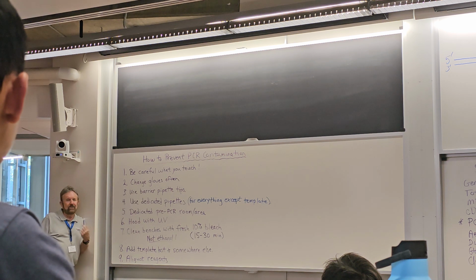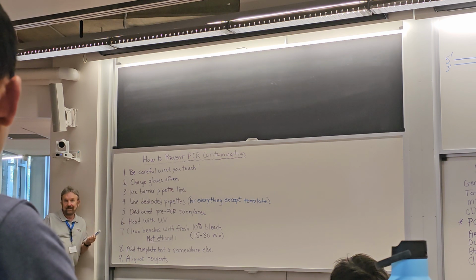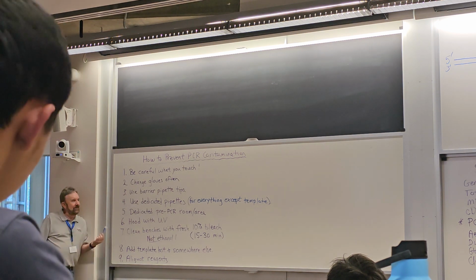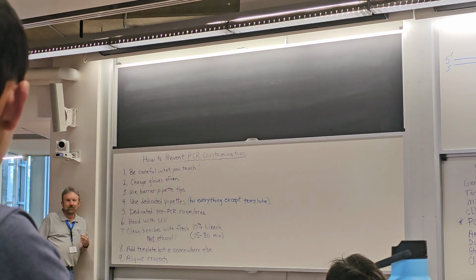You can dilute the Clorox to a 10% bleach solution, and that's ideal. Now, it turns out bleach doesn't last forever, and so you want to make up 10% bleach frequently, so we do bleach every week, and you don't buy too much at a time, and then when it runs out, run down to Stop and Shop.